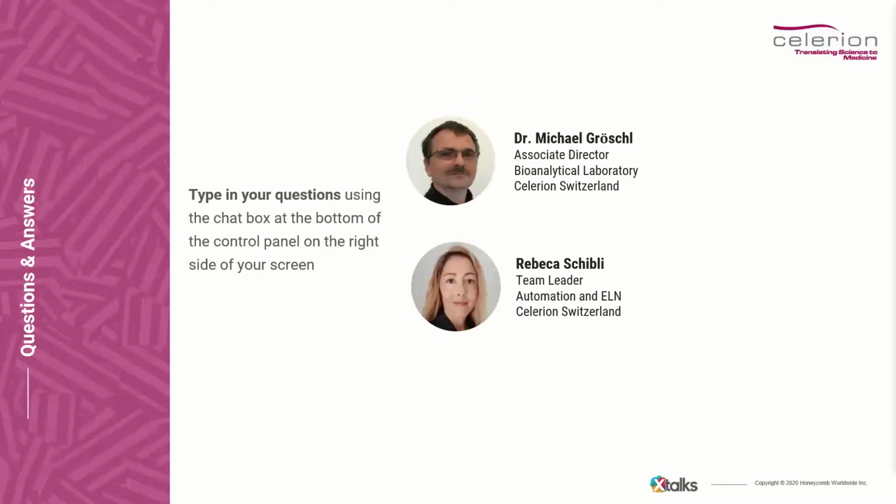We started to introduce, back in 2013, where we purchased the first Hamiltons. We were first, of course, working with older models from other vendors, which I would not consider as today's state-of-the-art systems. But from 2013 onwards, we developed all these new systems, validated them, brought them online, described and defined our processes to come to the status that we have right now.